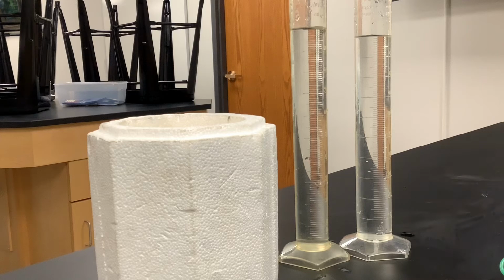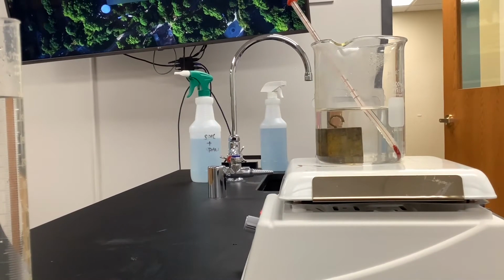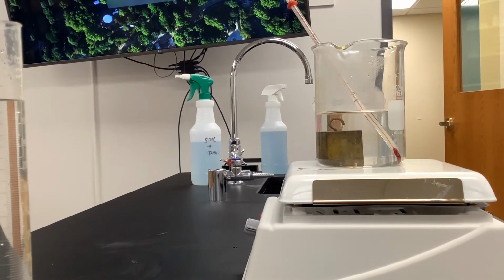All right, this is the calorimetry lab. We are going to be collecting data to identify unknown metal cube number 2. So this is unknown metal cube number 2 in that beaker of boiling water right now. I'm going to go through and collect the data.